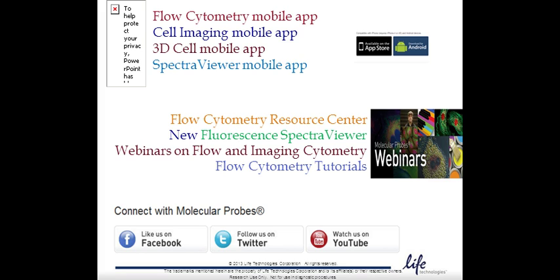So I have one question here. Why can't you wash after adding a DNA stain? It's best to add a DNA binding stain as the last step in your protocol and not wash it out. The dye is essentially non-fluorescent until bound to DNA, so it shouldn't add any background.